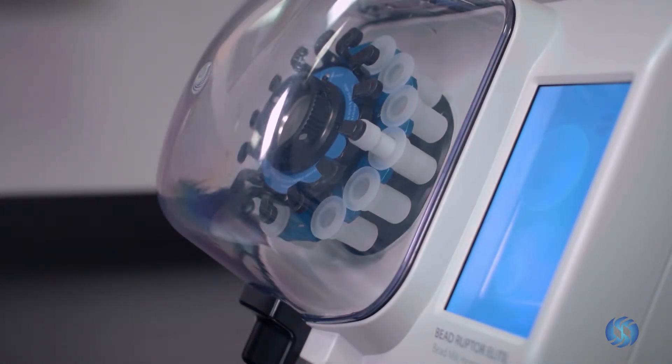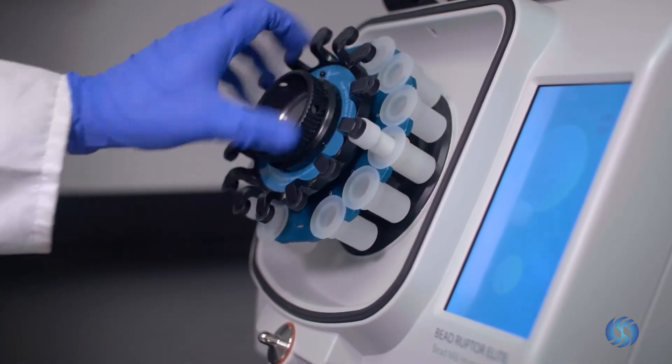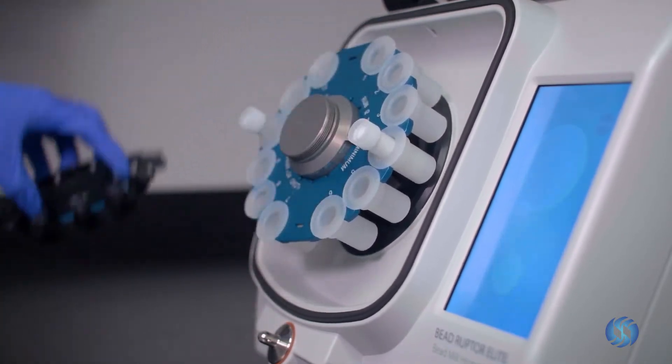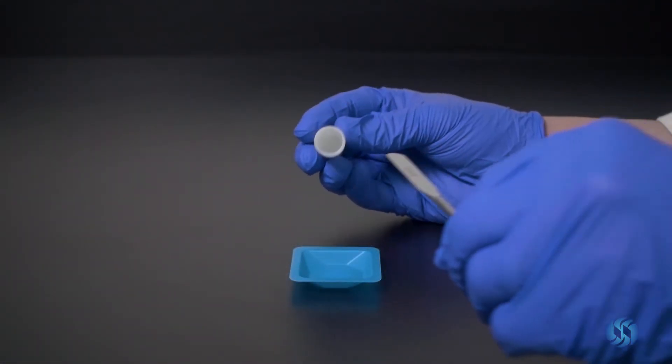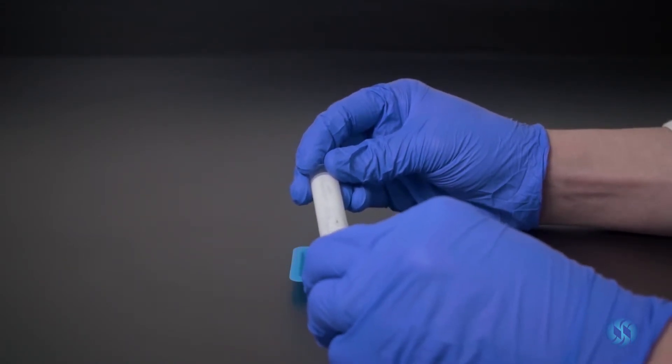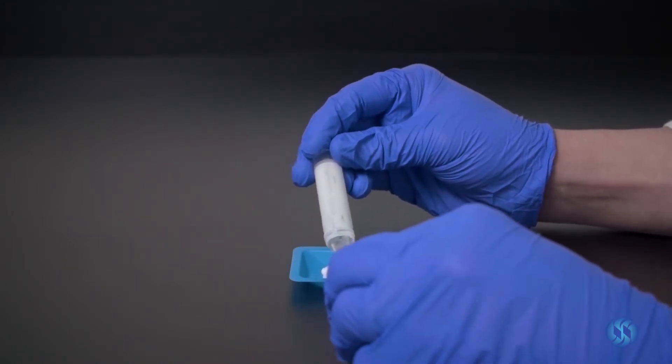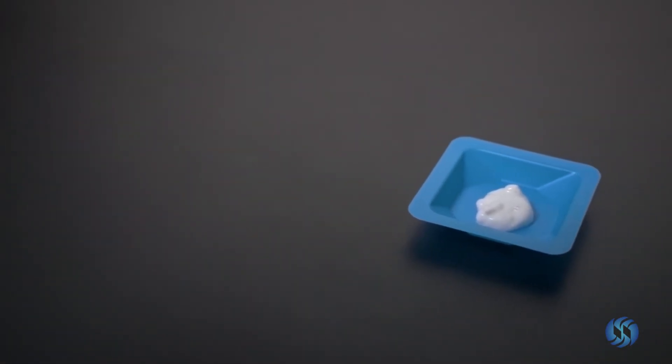When processing is complete, remove the 7-milliliter tube from the BeadRuptor Elite. Your emulsion is now ready for injection.